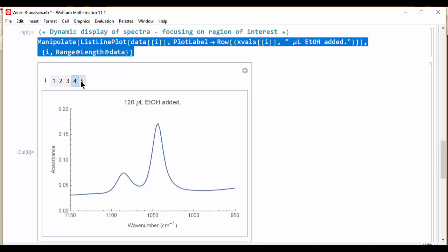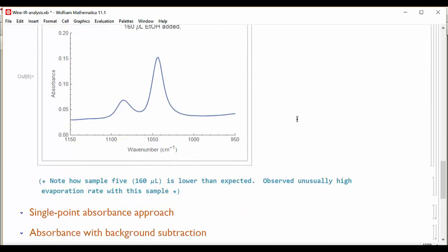We saw a general increase until this last point here, and it looks as if the fifth data point has some sort of experimental error associated with it. It should continue to go up but it clearly does not in that case. So I suspect that that point is going to have to be removed at some point.